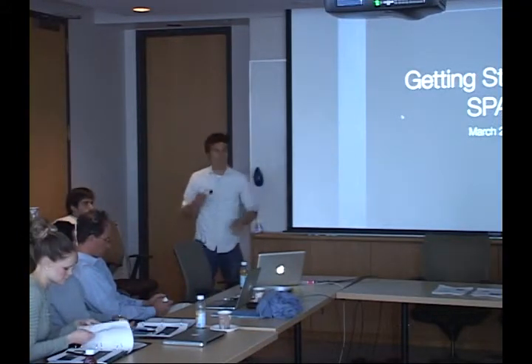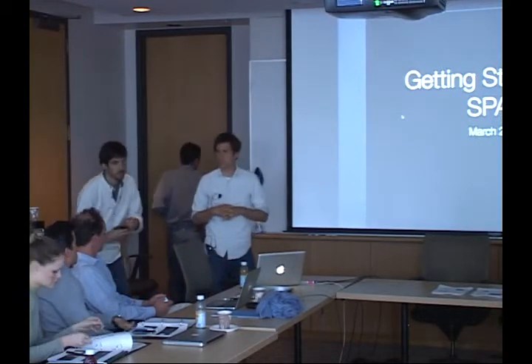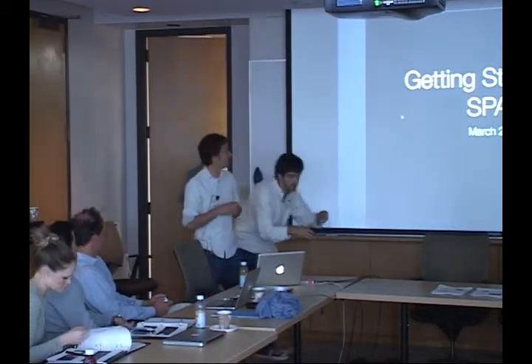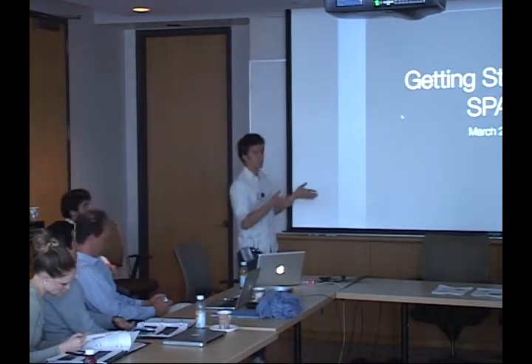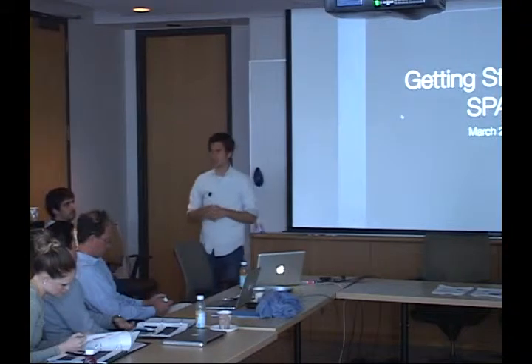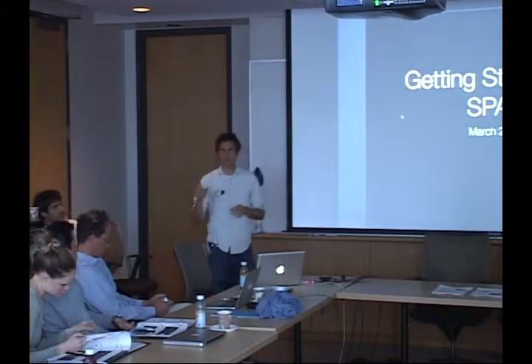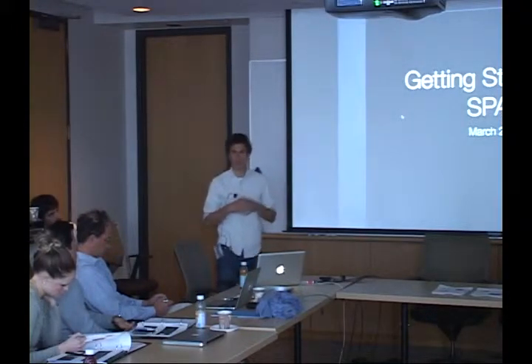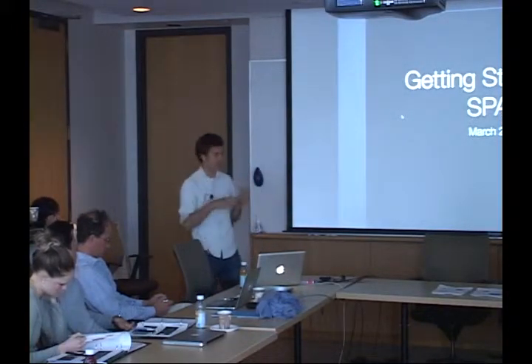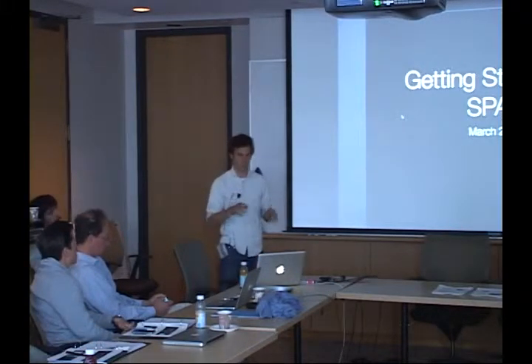Okay, so my name is Rob. I'm a very senior graduate student in the Nolan Lab. What I'm going to show you today really quickly is how to use SPADE in Cytobank, if that's what you're interested in using to analyze your data. And if we have a little bit of time at the end, I'll get to some additional work I've been doing on testing or developing methods that allow you to test specific hypotheses within your data.